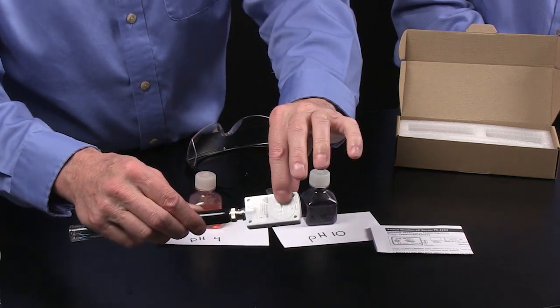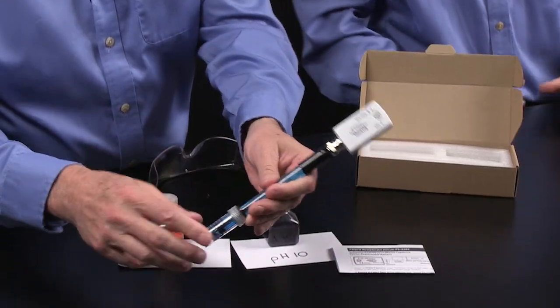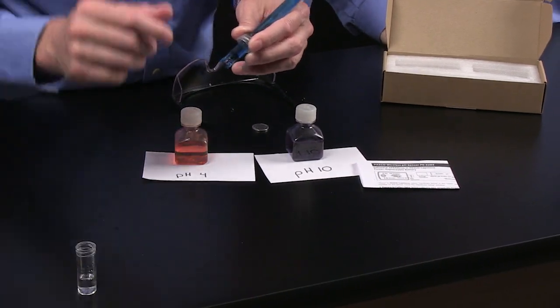There is a battery in the back which you won't have to change very often, but it's a simple one you could buy at the grocery store. It's also waterproof — we can dip it in for a few moments and you shouldn't have any problems, so spills are no big deal. It comes with a storage solution; this is a four molar potassium chloride solution. It's going to get spilled in your classroom — we sell replacements, and you can make your own as well.